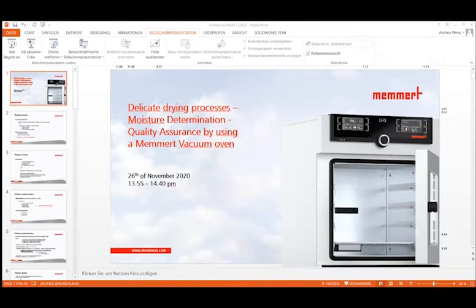And of course, very important are foods, pharmaceuticals and cosmetics. When we talk about these industries, the drying process is a very important key manufacturing step. In pharmacy, for example, it is the batch process, and the drying occurs during this batch process. Or in the food industry, dehydration is also called drying, and that means heating under controlled conditions to remove the majority of the water, normally by evaporation.